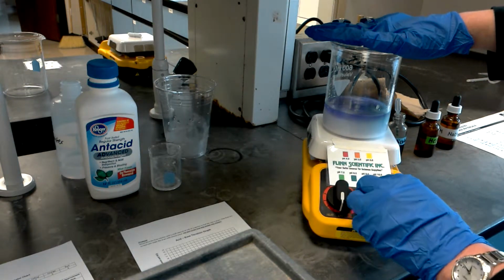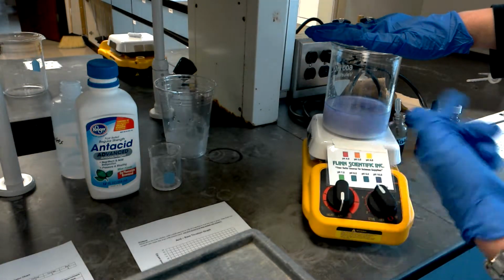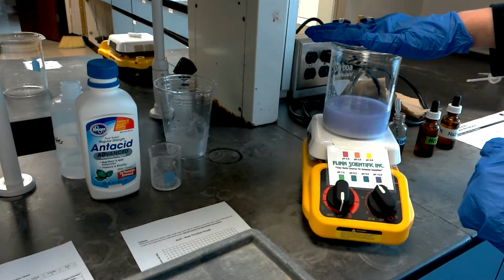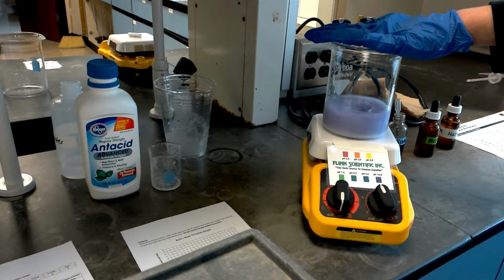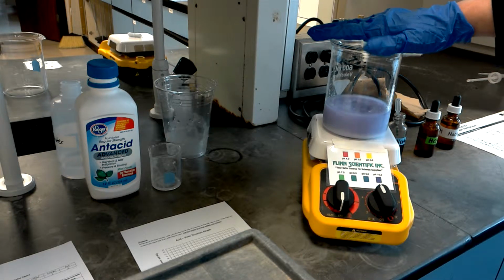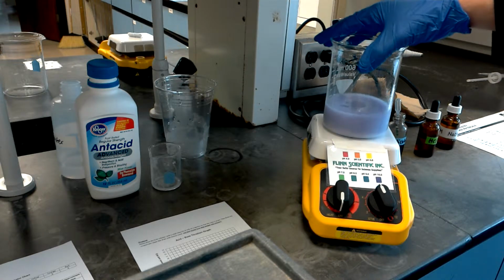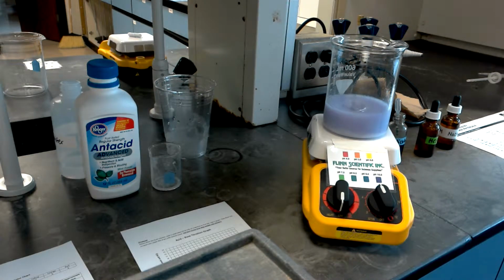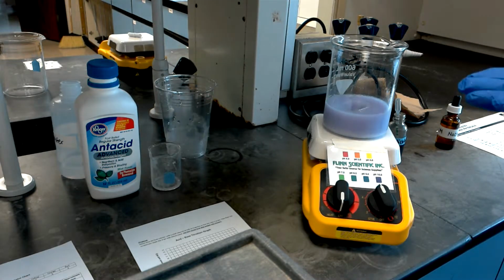All right, so we're going to go ahead and start our magnetic stirring plate, and that rod that's inside there helps stir the solution for you so that it becomes a well-mixed solution as you're adding your acid. All right, so we see now that it's a nice purple color, so we're going to continue to put in some drops of acid.